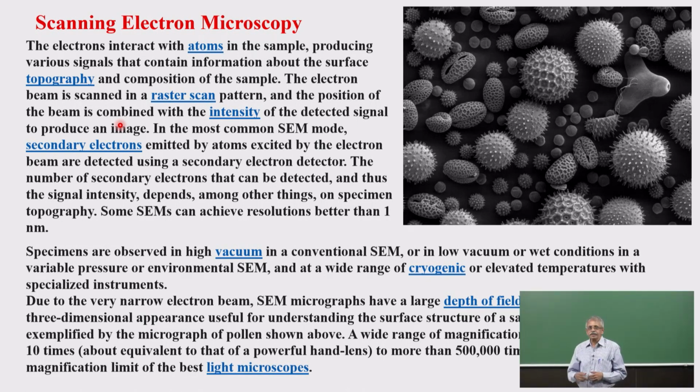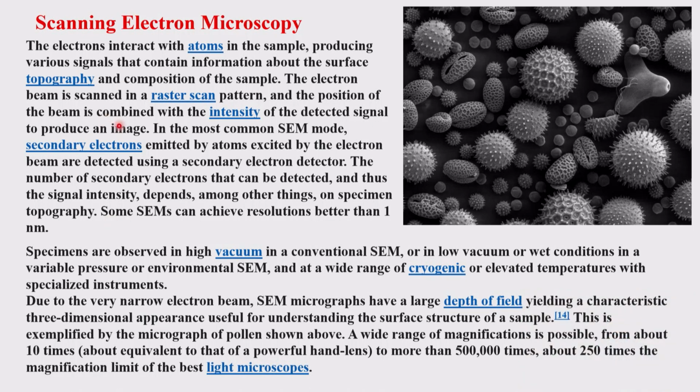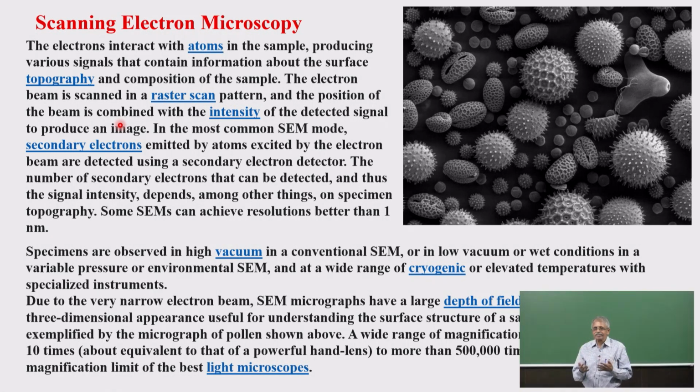Just like I have shown in case of TEM, you can differentiate various pathogens, other things based on their images based on the TEM. Here also, based on the images of the SEM you can differentiate that. The main SEM requires a large extent of vacuum technology, but now there are techniques which are developed where you can do it even with somewhat lower level of vacuum technology.